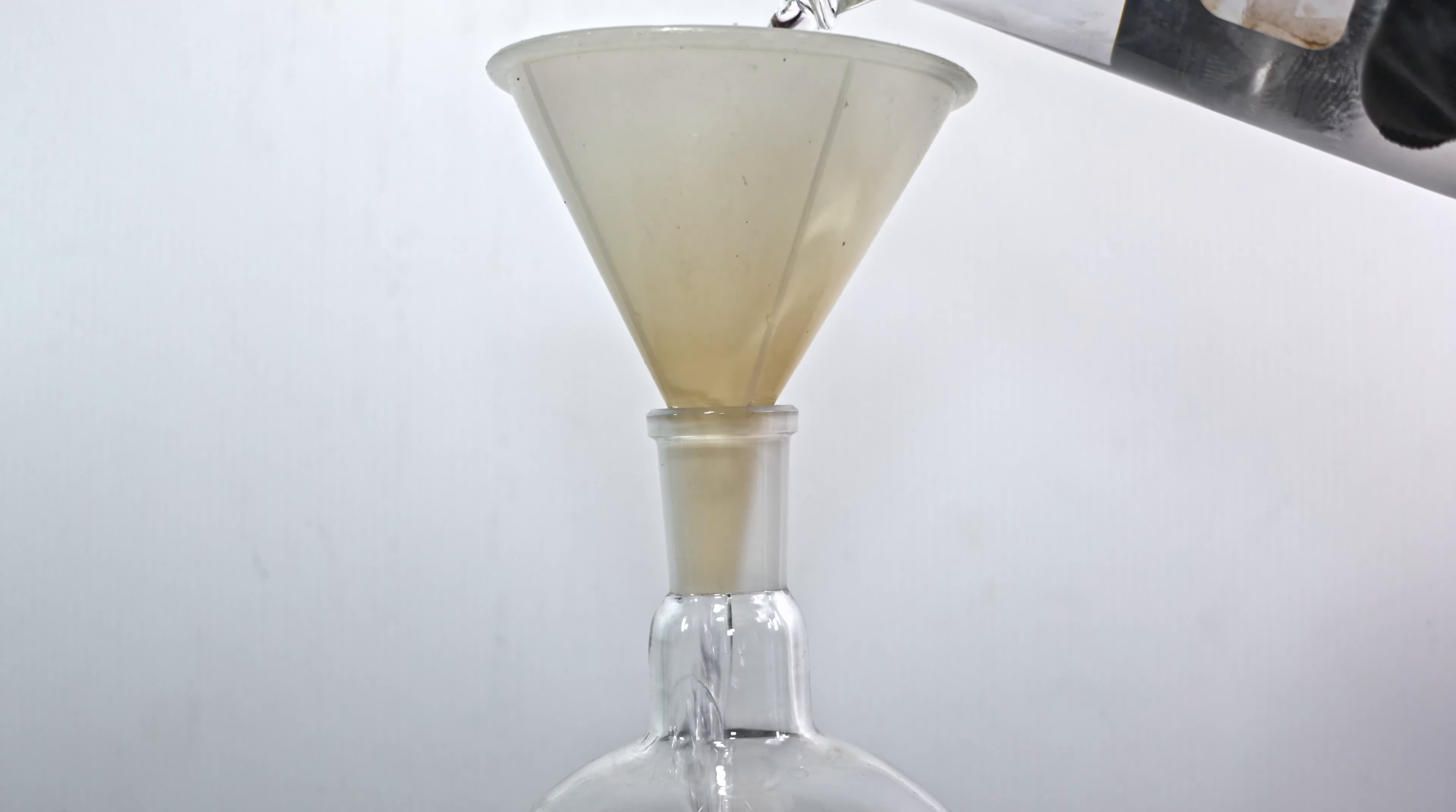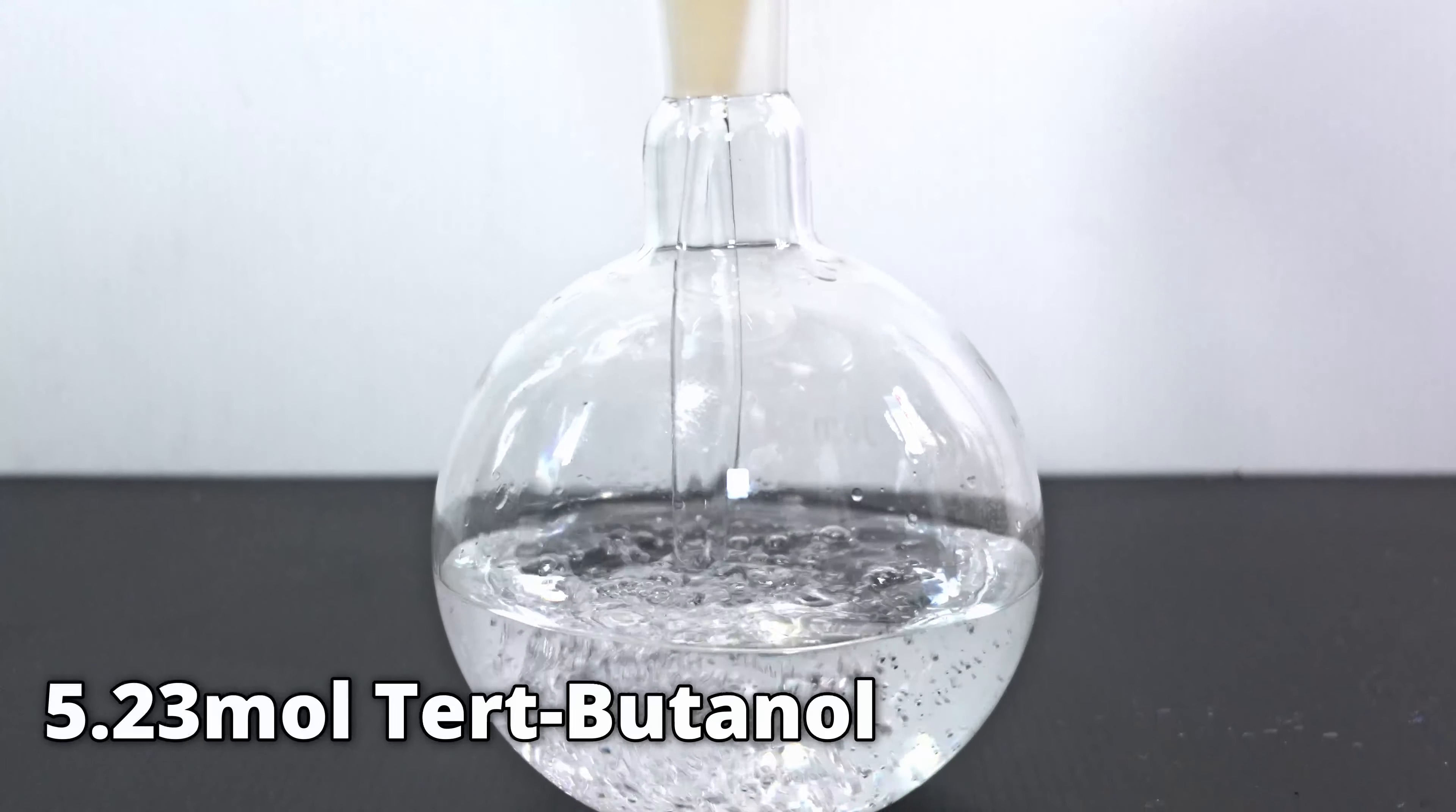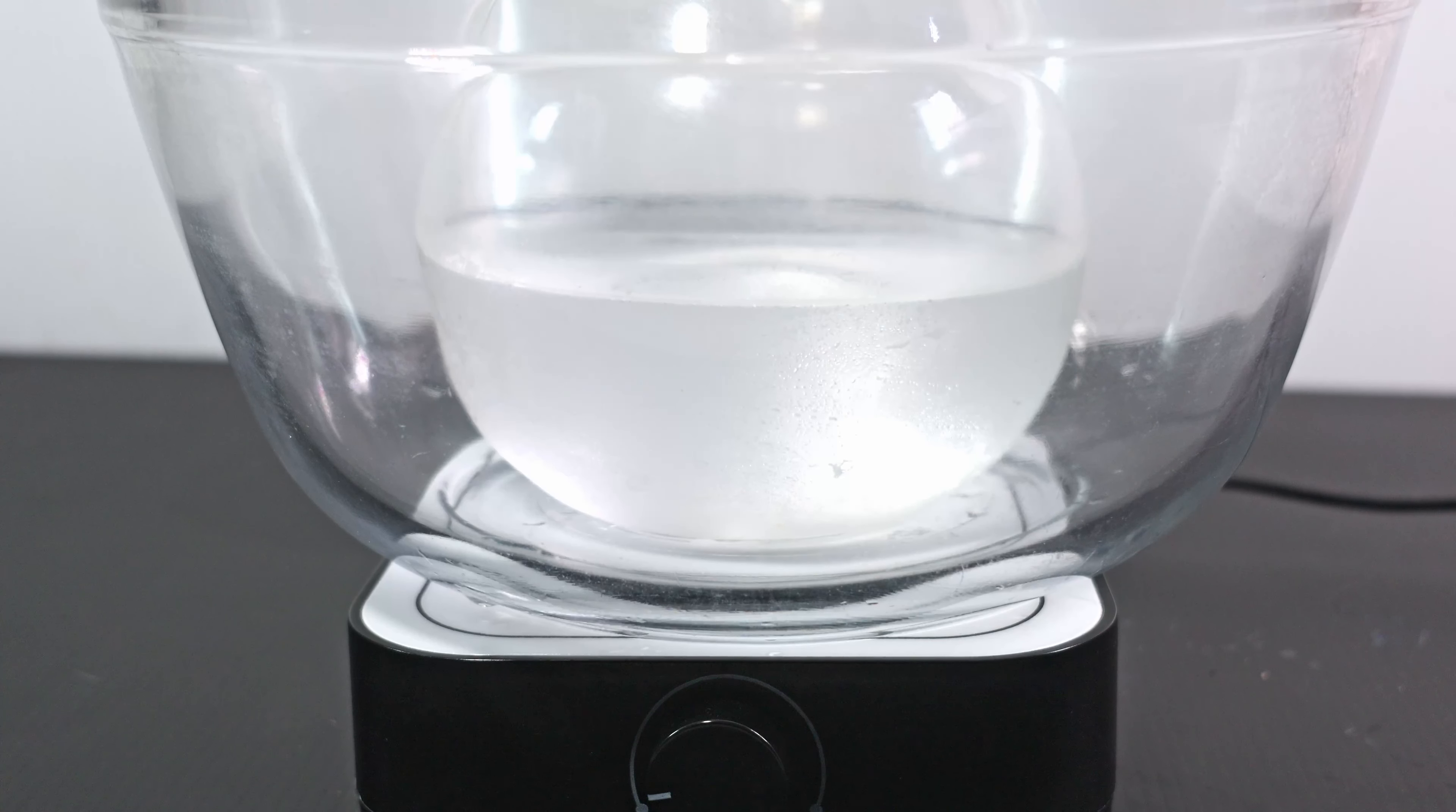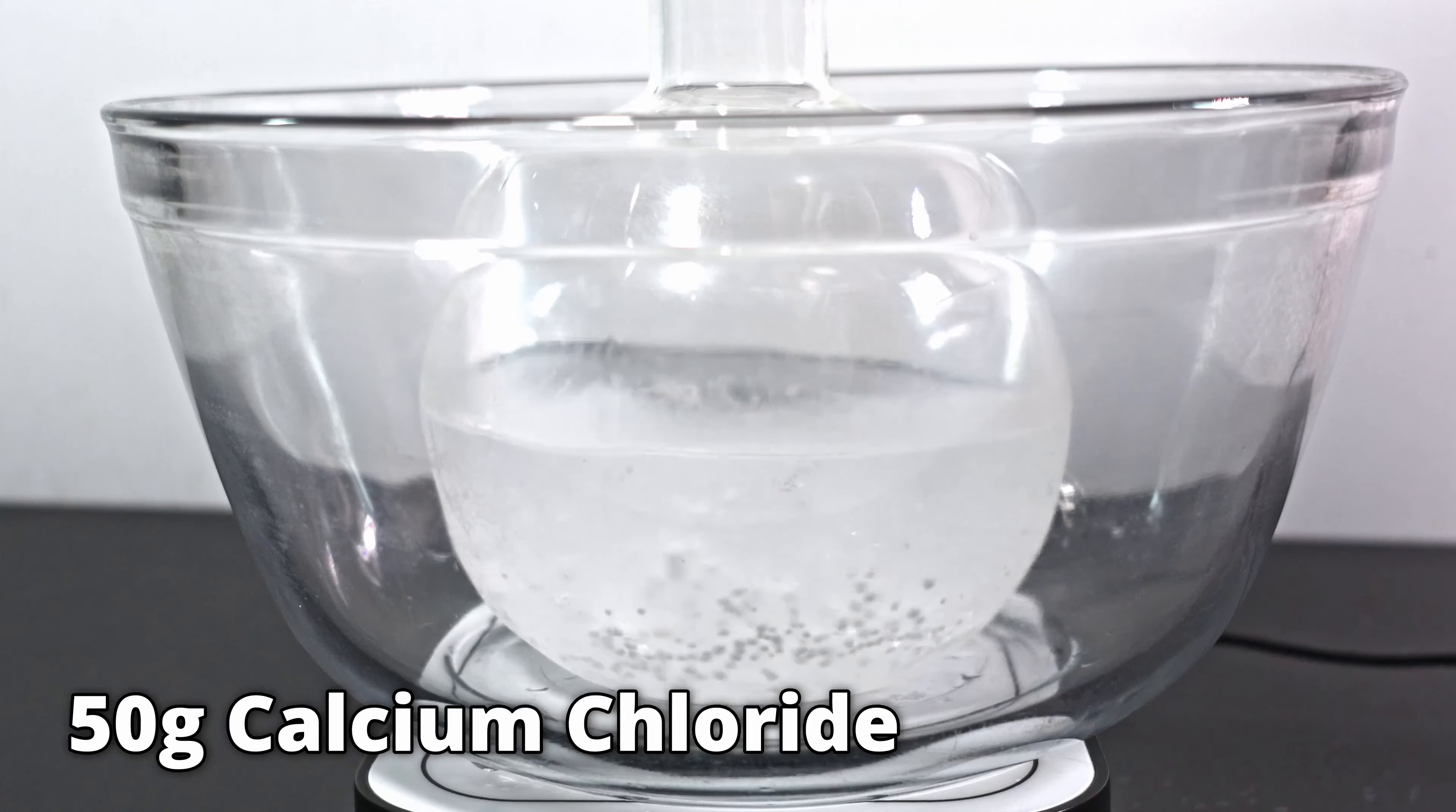The first thing I'm going to do is pour in 500 milliliters of cold tert-butanol into a 1 liter boiling flask. This is approximately 5.23 moles of tert-butanol. Then I'm going to drop in a stir rod and place it on a stir plate. I'm going to set the stir rate on high. That way, the calcium chloride will thoroughly blend instead of settle at the bottom.